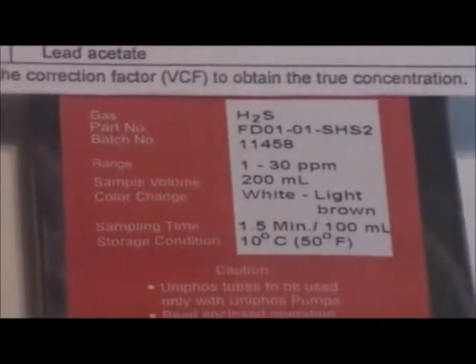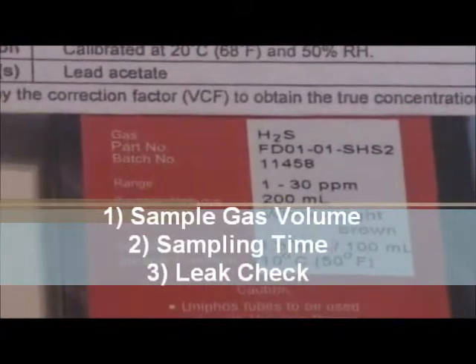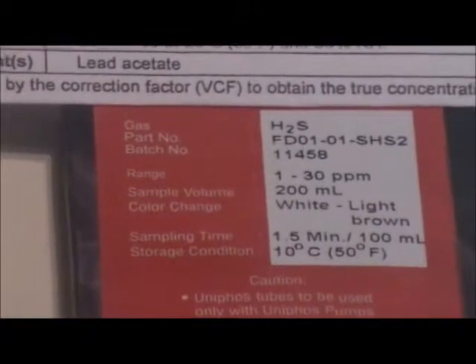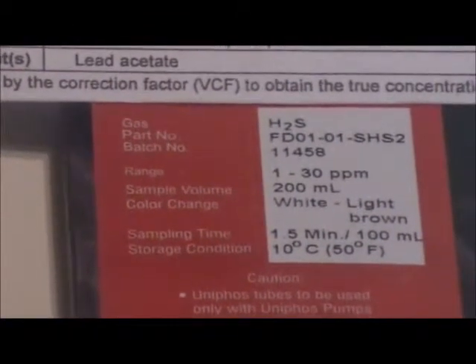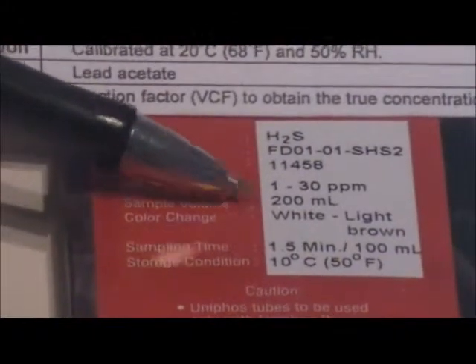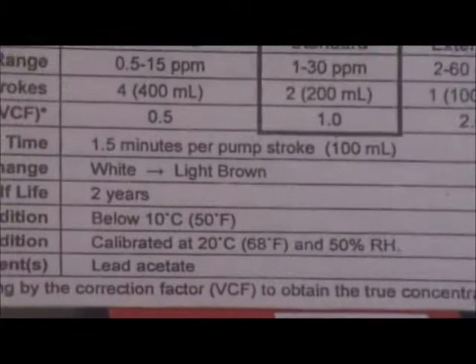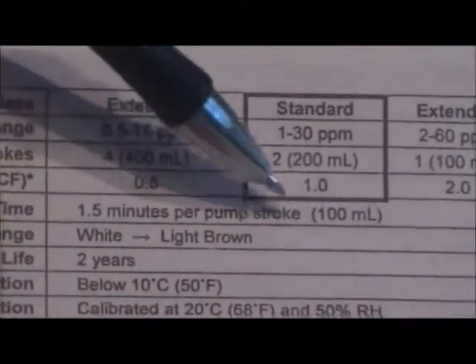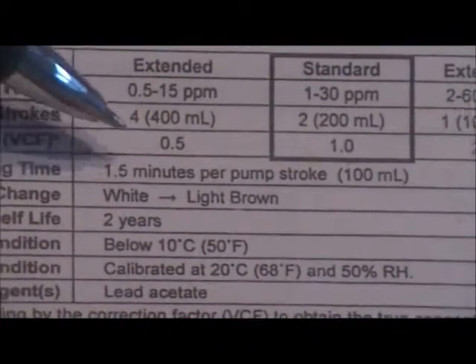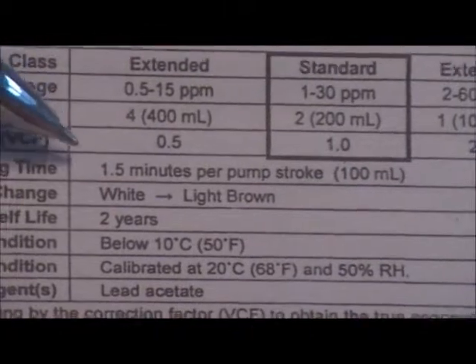Before starting a series of measurements you should know the sample gas volume, the time required for sampling, and perform a leak check. Sample volume and time are given on the outside of the box and on the tube sheet enclosed in each box — the standard range showing two pump strokes for 200 cc's, with each stroke taking one and a half minutes for a total of three minutes for sampling.